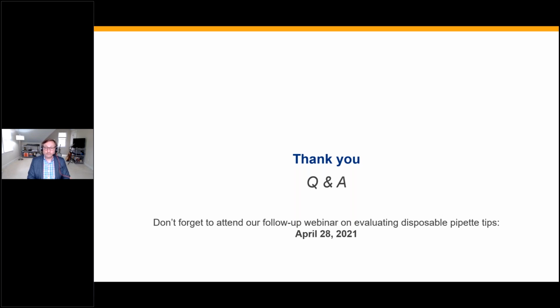It also looks like we've got someone, Matthew Hahn, wondering if manufacturers' liquid handling states a higher precision or accuracy than the MVS, how much discrepancy can you expect? I haven't seen anyone do it higher than, and it's all about uncertainties. The uncertainty measurements we've got documented. You can pull that up on our website if one is interested. But I'm not aware of a liquid handler that has tighter specifications than what we can measure.